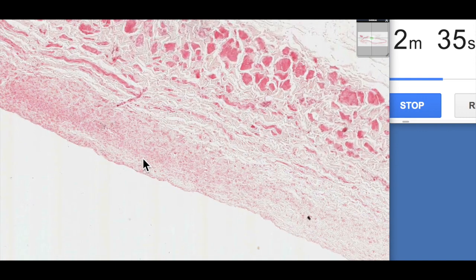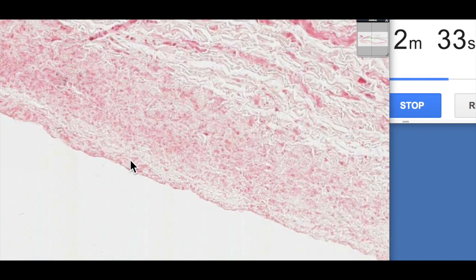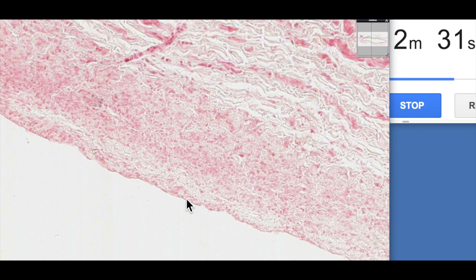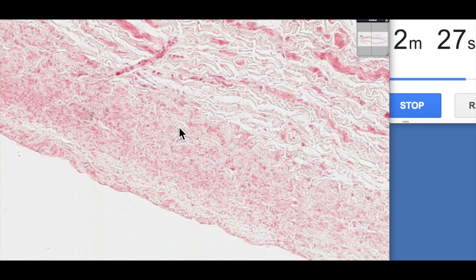If we zoom in, here's the tunica intima. It's not really that much to see to be honest. There's a simple squamous lining, endothelial lining and then here's the tunica media.